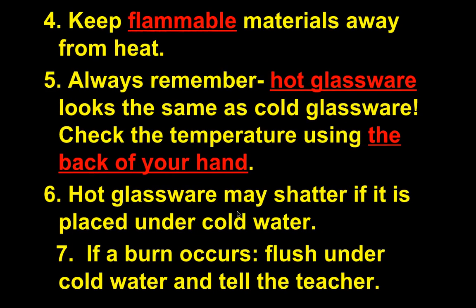Keep flammable materials away from heat, including your hair and clothing. Remember that hot glassware looks exactly the same as cold glassware. If you come into class and the previous class just finished a lab, don't touch equipment without checking — you could burn yourself. If you ever need to check the temperature of something, use the back of your hand, not the front, so your natural reflex pulls it away if it's too hot.